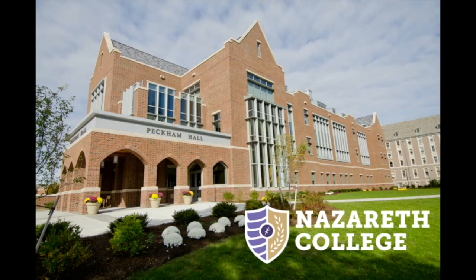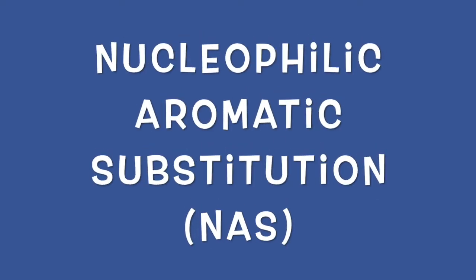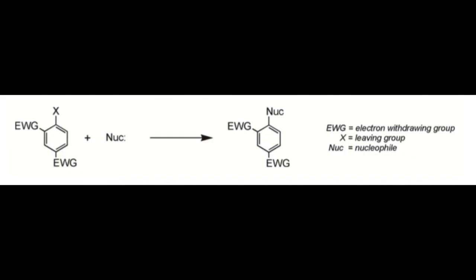Welcome to Organic Chemistry Lab at Nazareth College. Today in the lab, we will be doing a nucleophilic aromatic substitution experiment, or NAS. In this reaction, a nucleophile attacks an electron-poor aromatic molecule, resulting in the substitution of a leaving group.